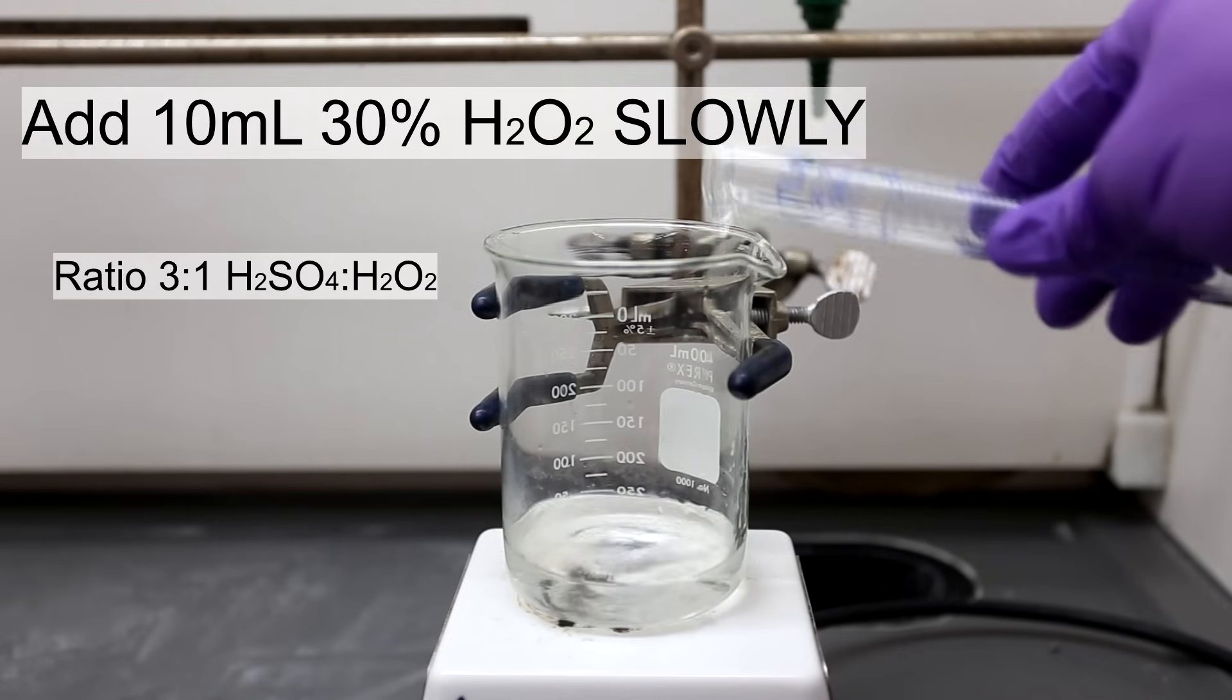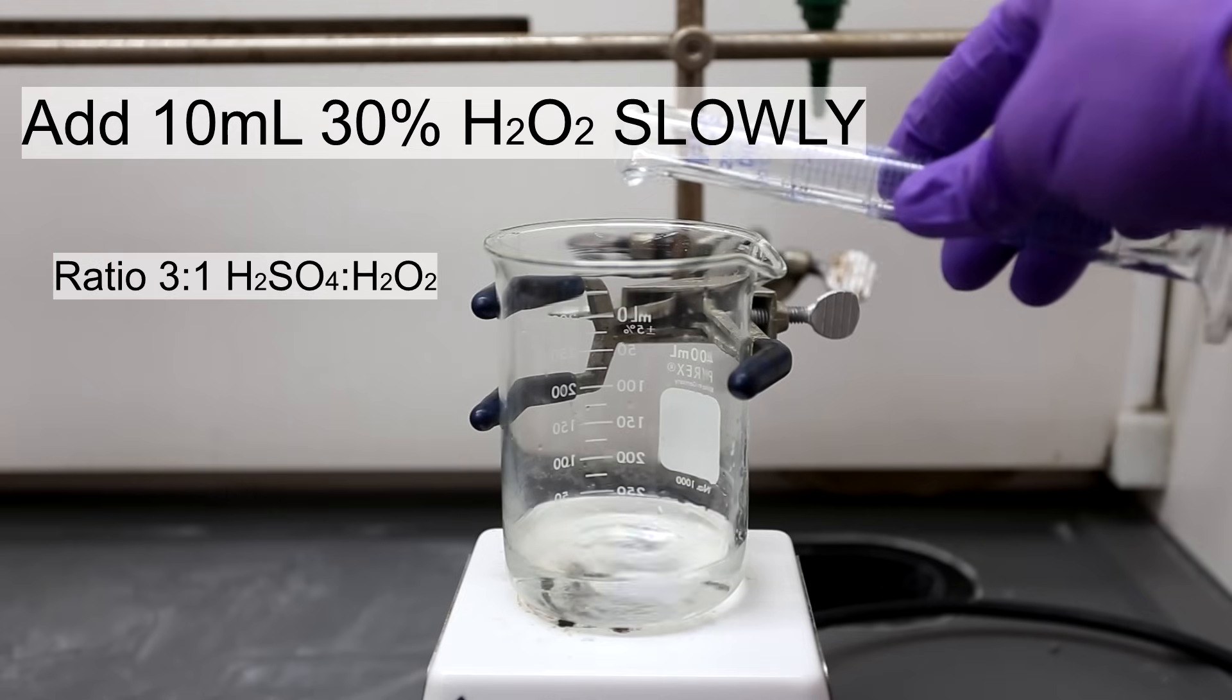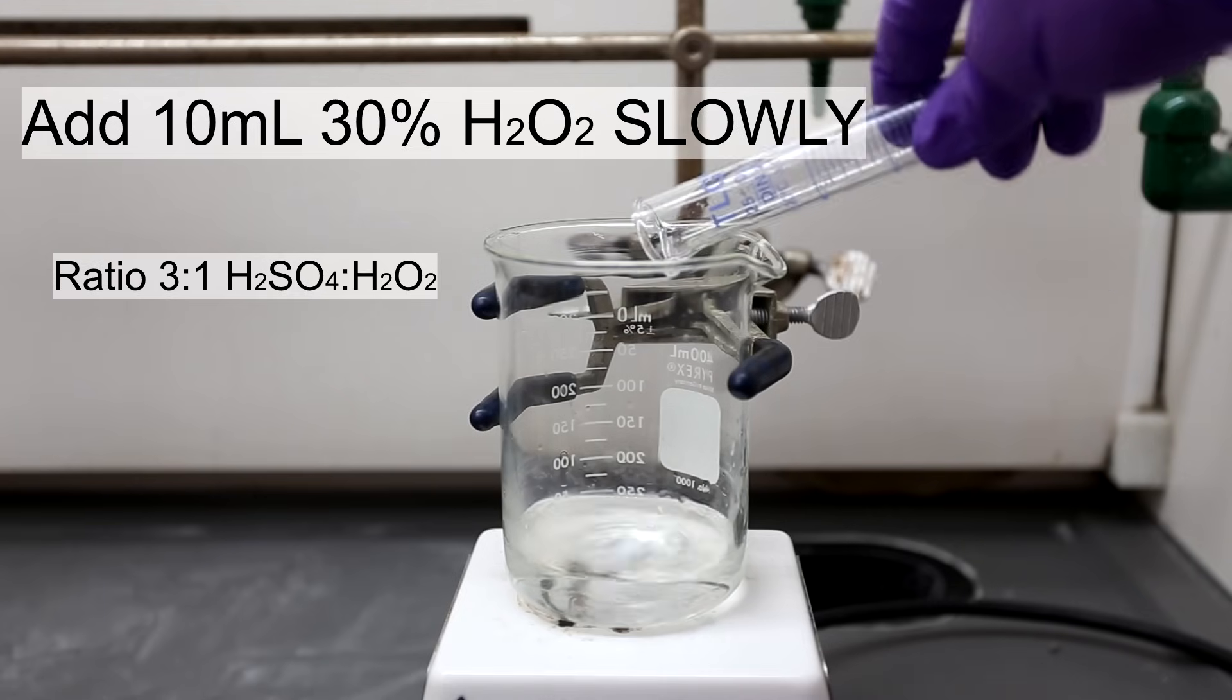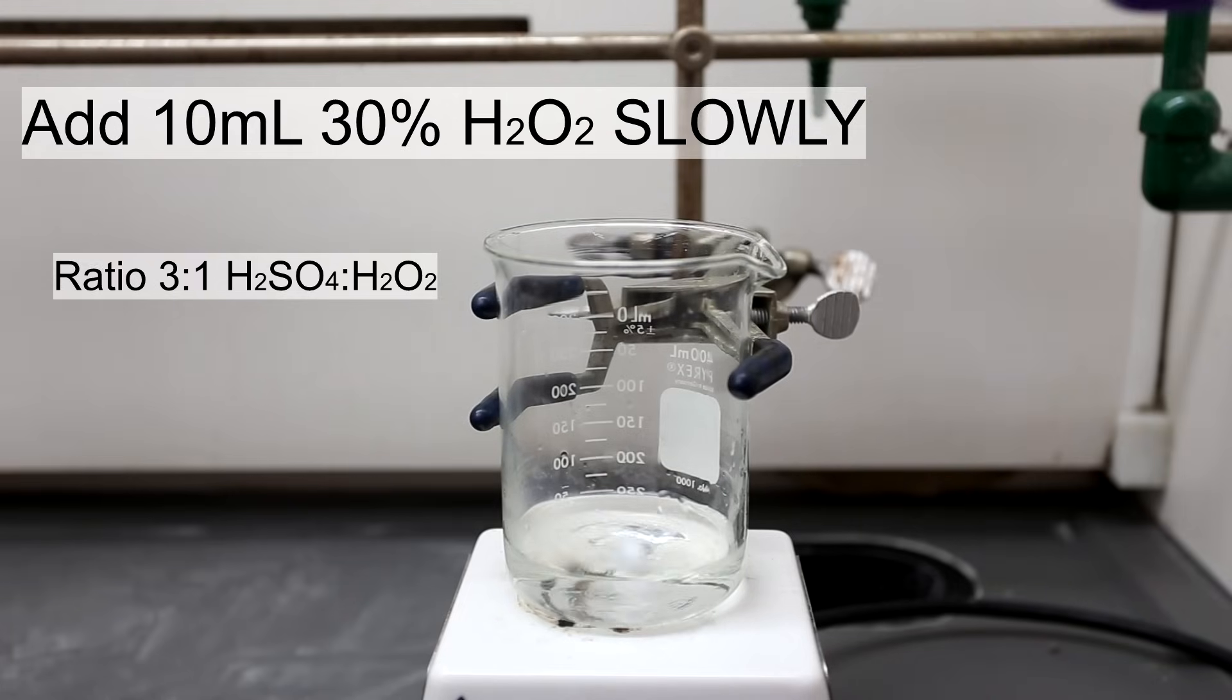It is extremely important that you add the hydrogen peroxide to the sulfuric acid and not the other way around. The mixture can become extremely dangerous or even explosive if the concentration of hydrogen peroxide is too high.